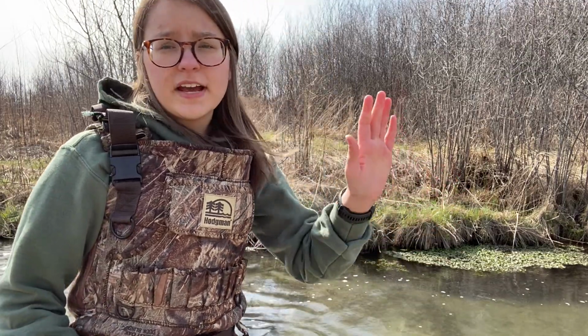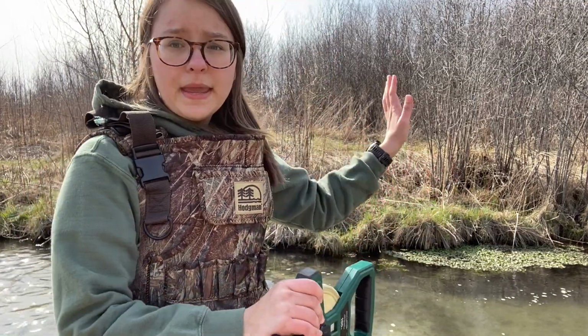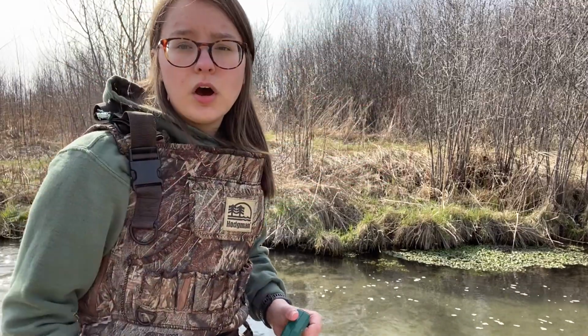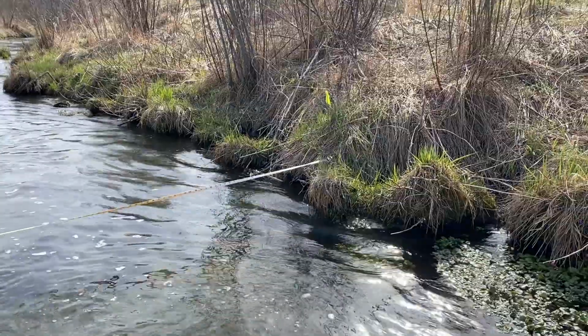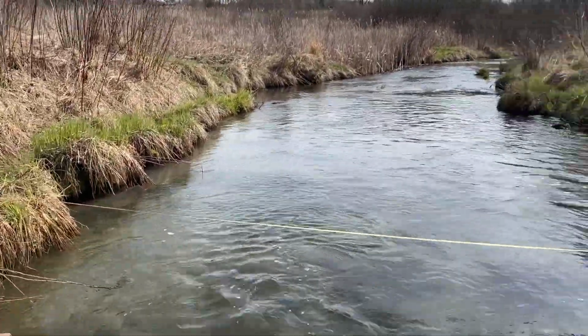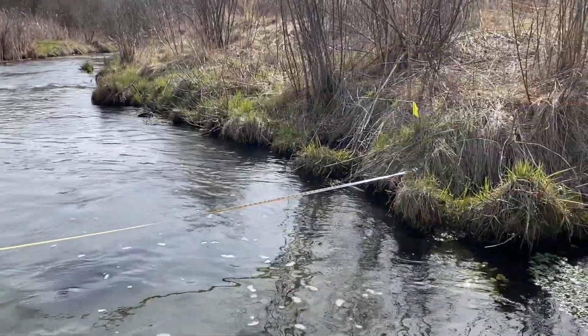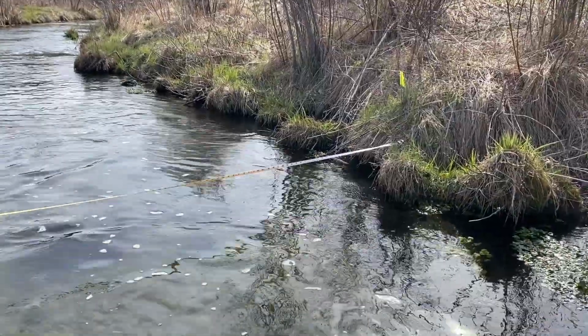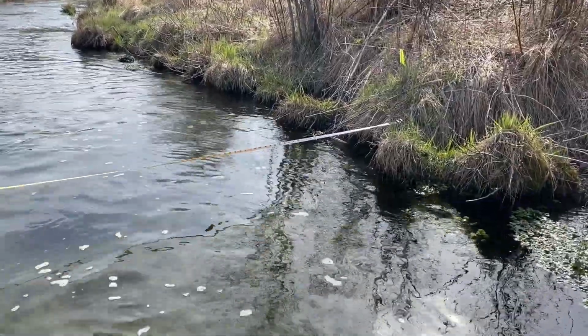This takes a cross section of the stream, so from bank to bank, and we measure the different depths of the creek along each foot. As you may be able to see, I put the tape measure across from bank to bank, and at each foot mark, I will take my net and measure just how deep the water is and record it at each foot.